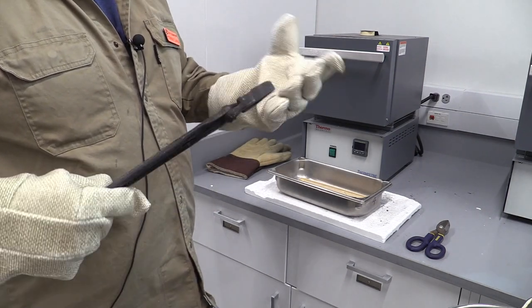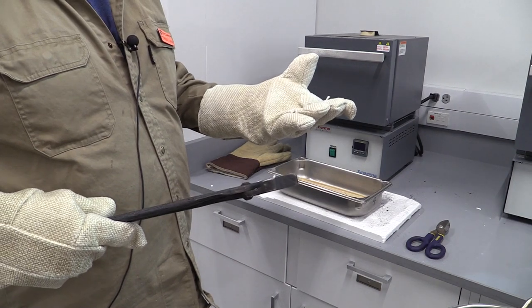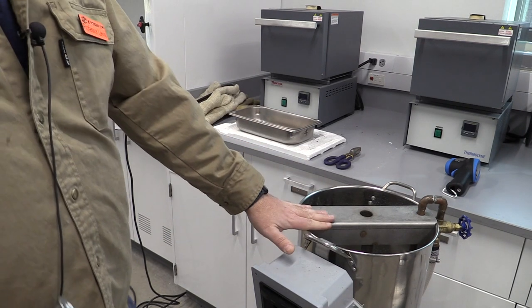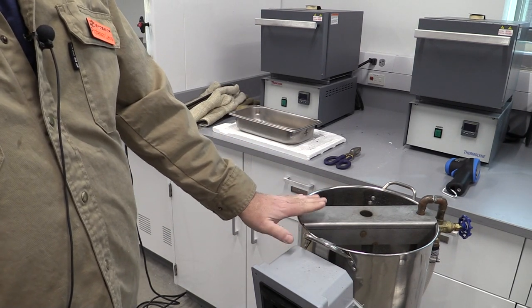What's going to happen is that paper is going to burn off and create a protective atmosphere inside. While the part is soaking in the furnace at temperature, you can come over and adjust and learn how to use the Jominy quench stand.